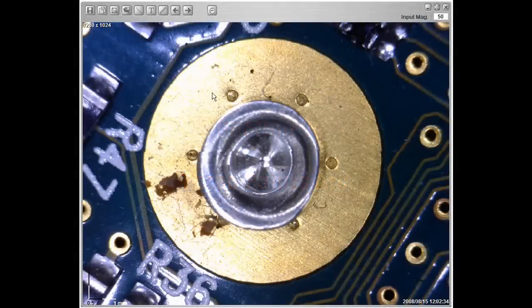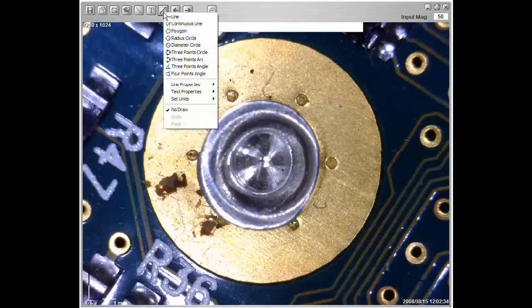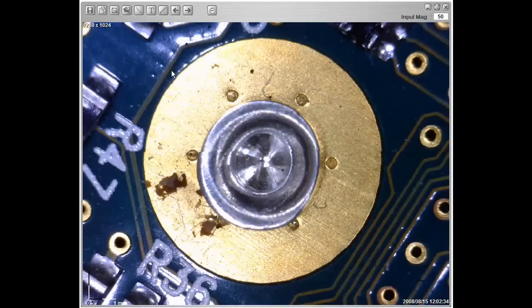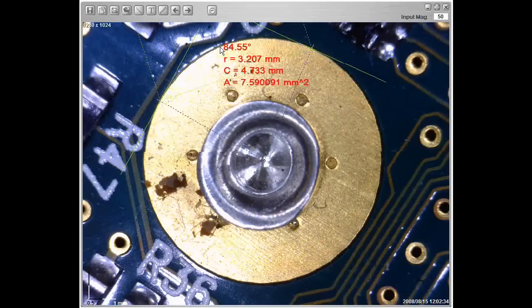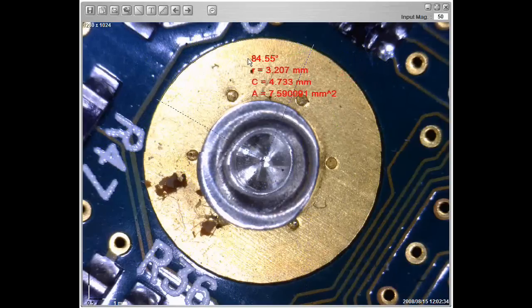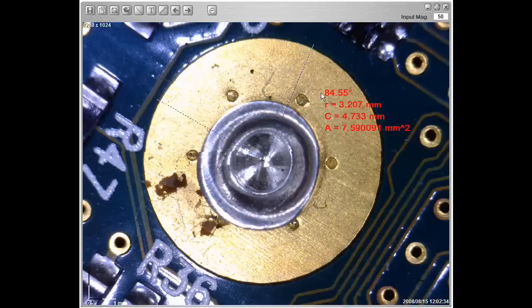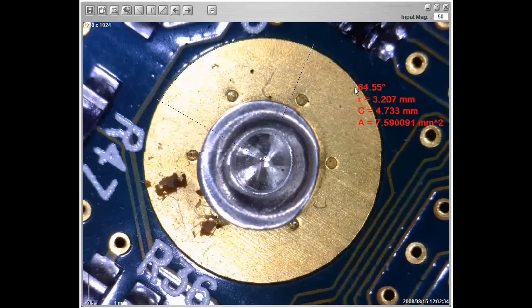Select three points arc to start measuring an arc. Start by selecting one point of a chord on a circle, then select the other end of the chord. Now place the last point that is tangent to the arc of the circle, and finish the measurements by placing the results.